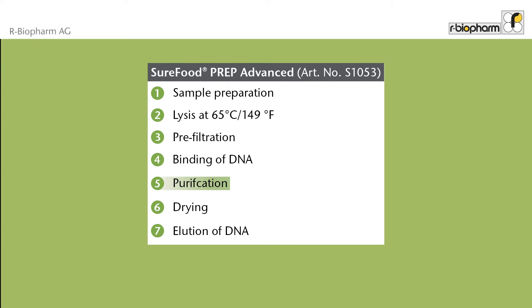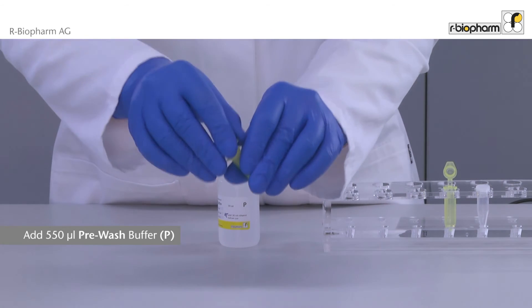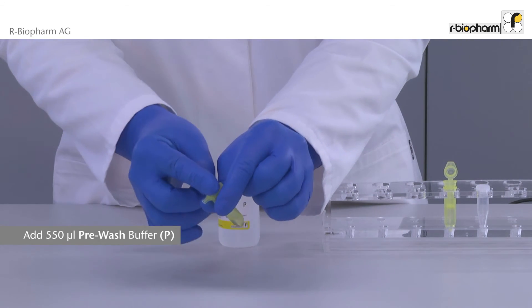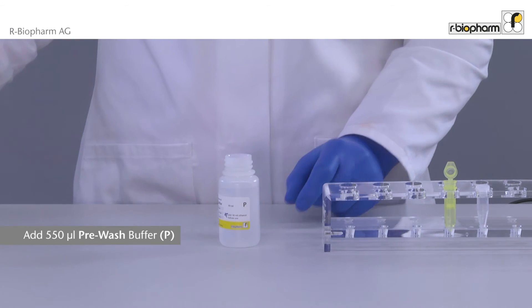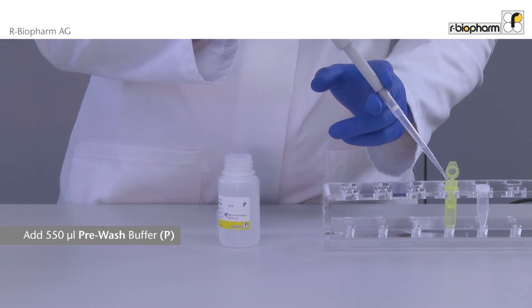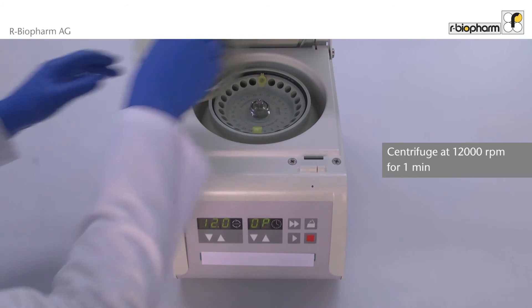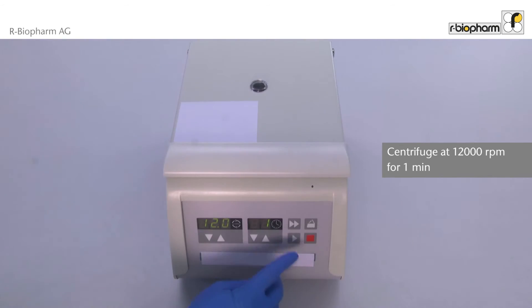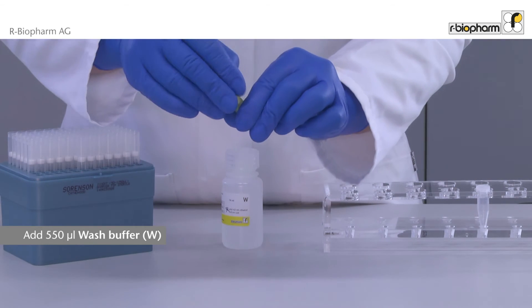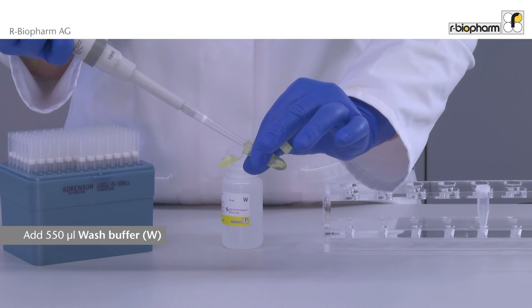In the fifth step, inhibitory substances are removed by three washing steps. The yellow spin filter containing the DNA is transferred to a new yellow receiver tube. Add 550 microliters pre-wash buffer to the spin filter. Centrifuge at 12,000 rpm for one minute. Remove the filter with a pipette and put the spin filter back into the receiver tube.